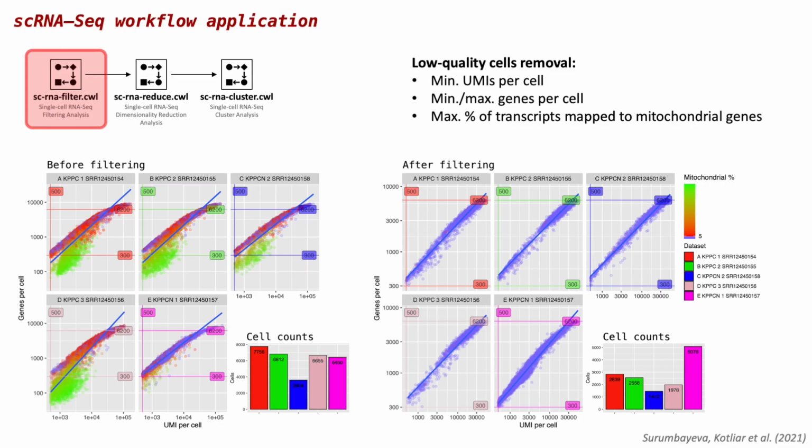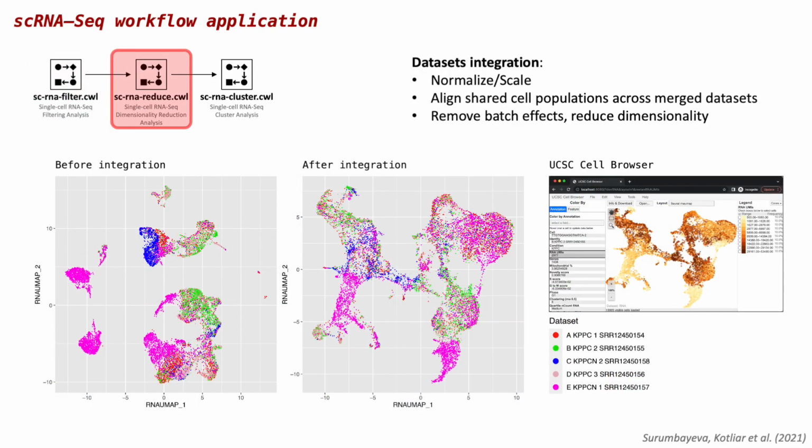In that study, we jointly analyzed 5 single-cell datasets, 3 from the classical cancer and 2 from the basal subtype. Here we see some of the figures produced by the first step of the data analysis workflow. The aim of that step was to remove low-quality cells based on the calculated QC metrics. These plots show genes versus transcripts per cell correlation, as well as the total number of cells per dataset before and after filtering. The next step was to integrate datasets together and reduce dimensionality.